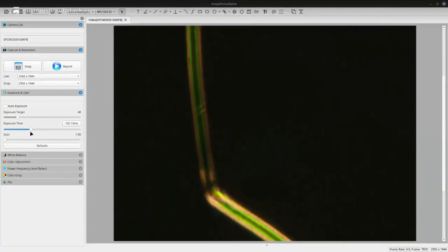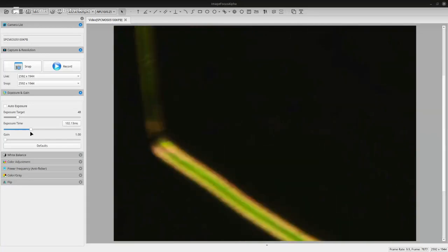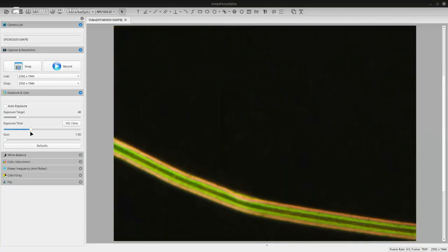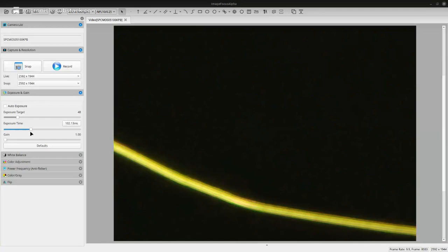There's a major crease, a change of direction. As it changes direction, the birefringence changes. Maybe that's the actual proper focus there.